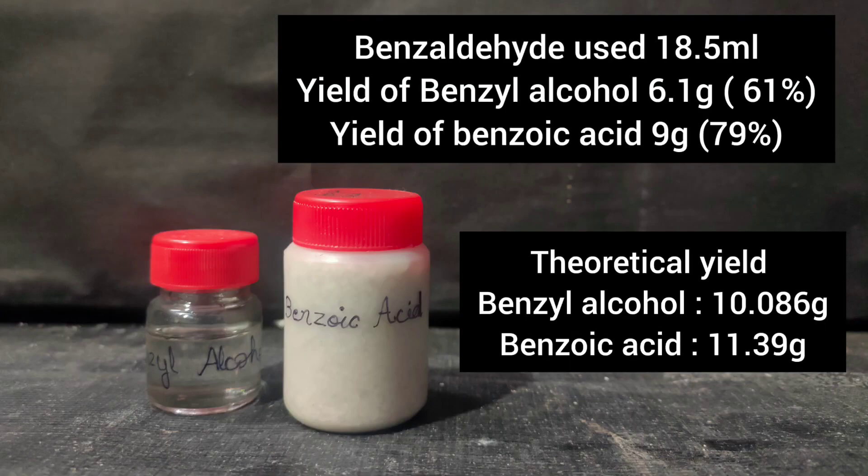Theoretically, benzyl alcohol and benzoic acid should have been formed in equimolar amounts. But yield of benzyl alcohol is significantly lower than benzoic acid as it has to go through solvent extraction and distillation, whereas benzoic acid is just precipitated from the aqueous layer and undergoes recrystallization. So some benzyl alcohol would have been lost in the extraction process and some in distillation.